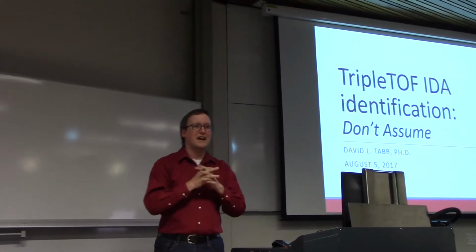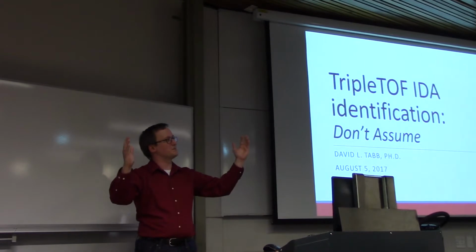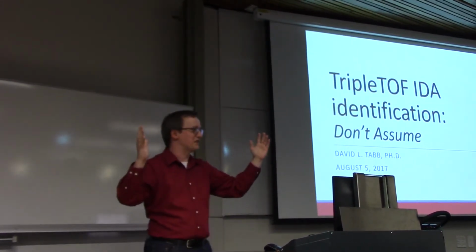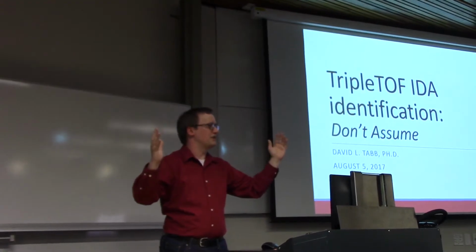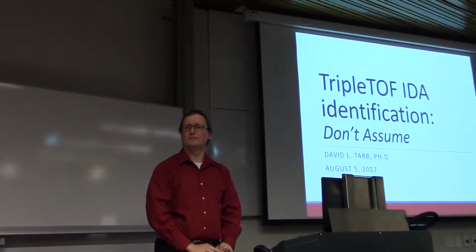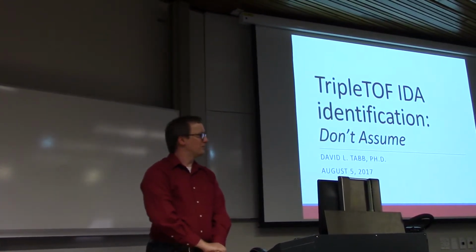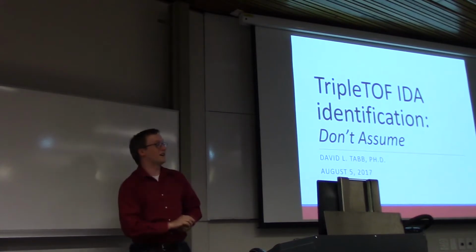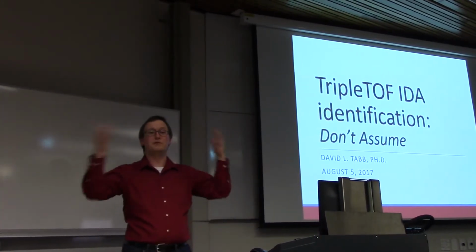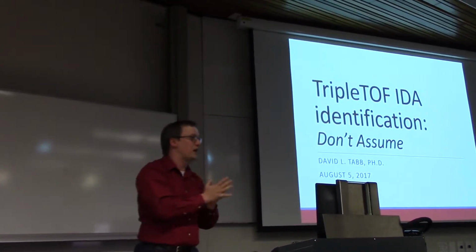Now, I'm going to ask you just a what-if question. If you were given a tandem mass spectrum that had the fragments of 25 different peptides in it, how would you determine the identity of those 25 peptides? You can just pause and think about that. With considerable difficulty. Considerable difficulty. All right. So we've mentioned the problems of convolution, that we have multiple fragments from multiple peptides all coexisting in the same space. That's a problem.